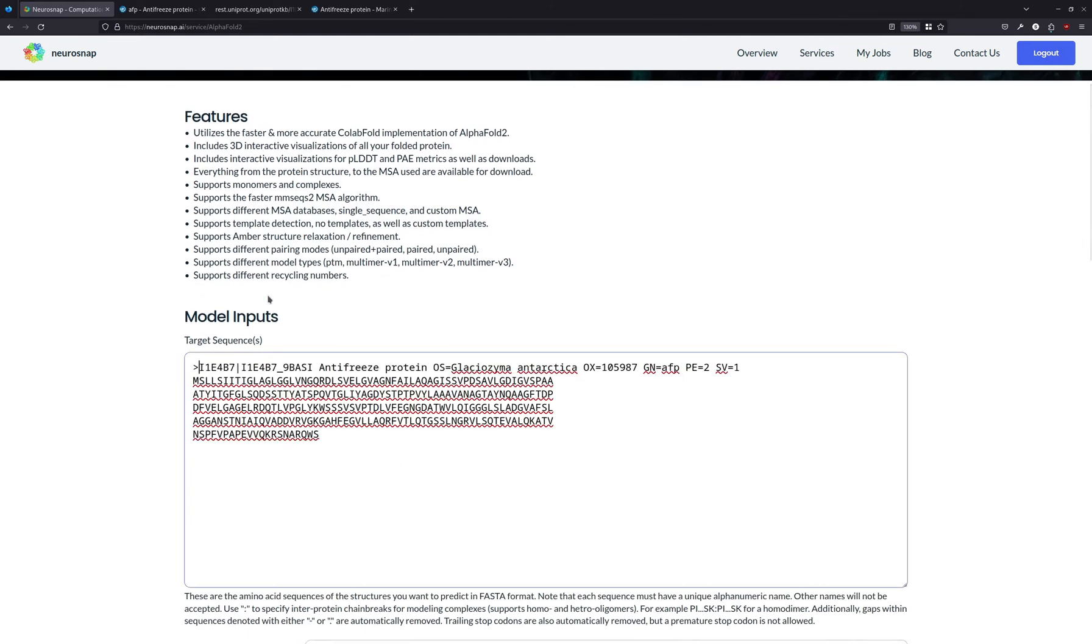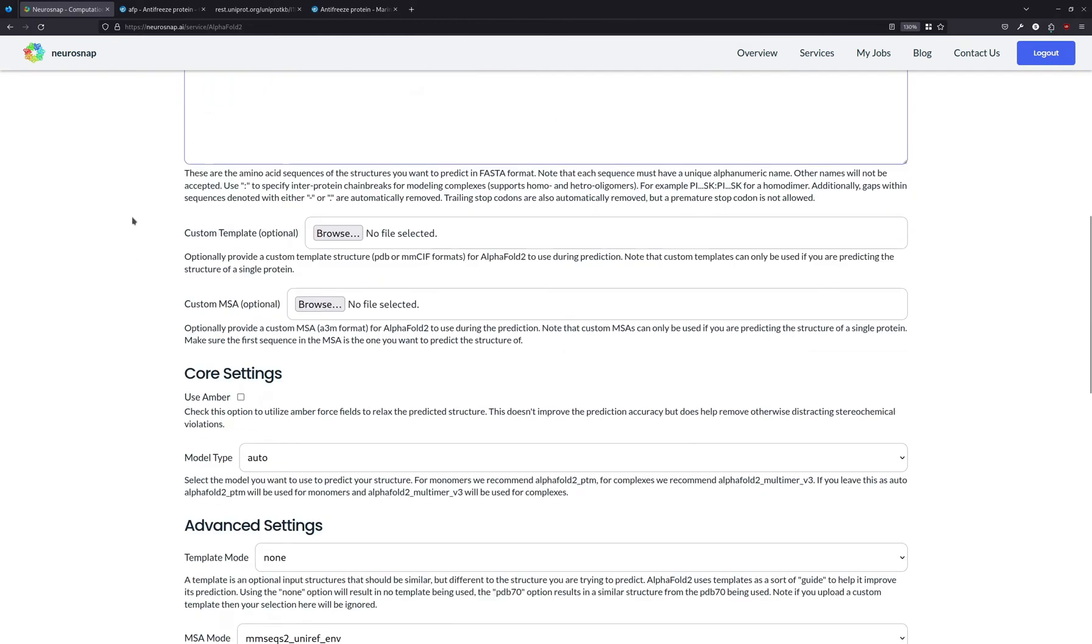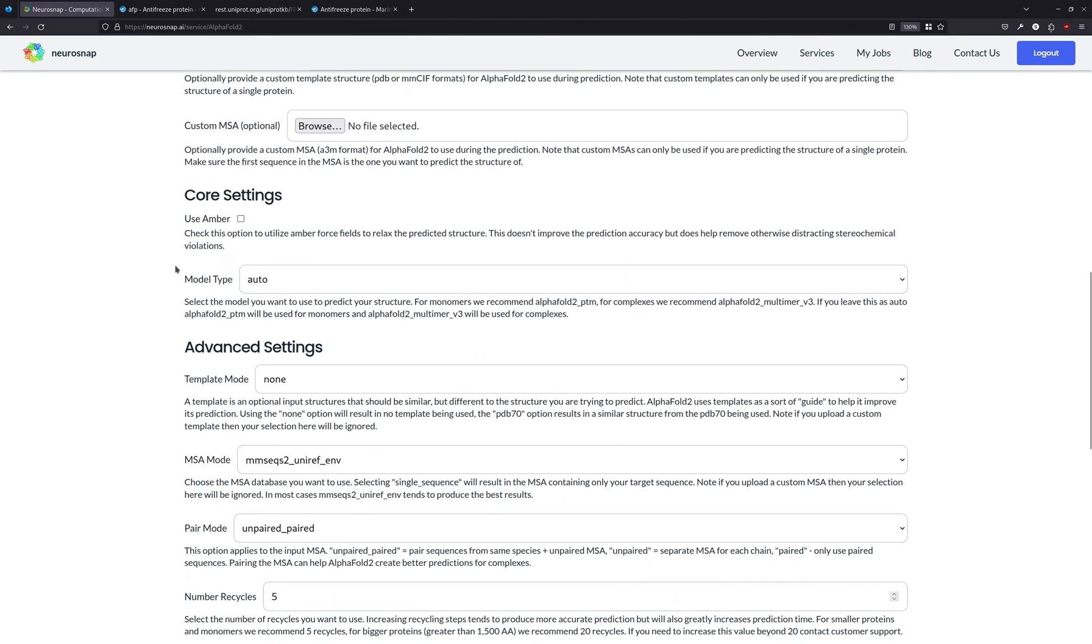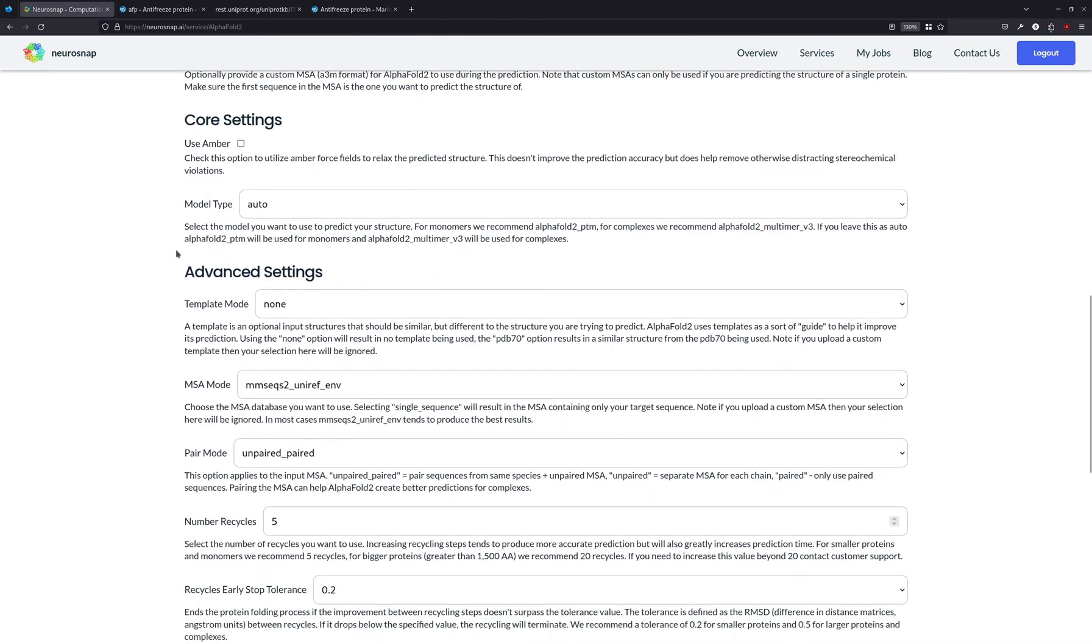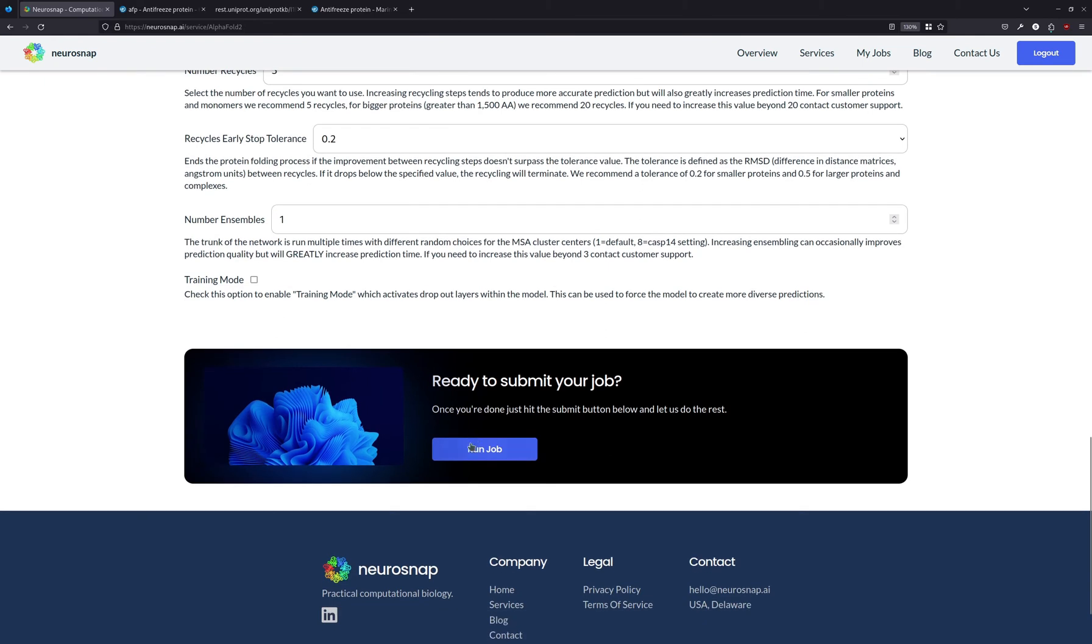We're just going to pretty it up and remove all the unnecessary garbage. So let me do that, and let me delete all this as well because it's unnecessary. And then we can tinker around with the settings. The defaults are already good enough, so we can just hit run job.